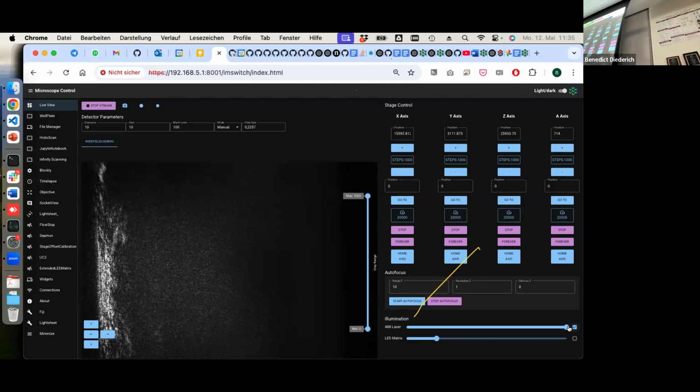Whenever you see 100 nanometer or 120 nanometer variation in one of the arms, that means that you go from black to white. So at home, for the students, there's a little heat element here, and then it's just expanding a bit, and you see that it's quite fast.